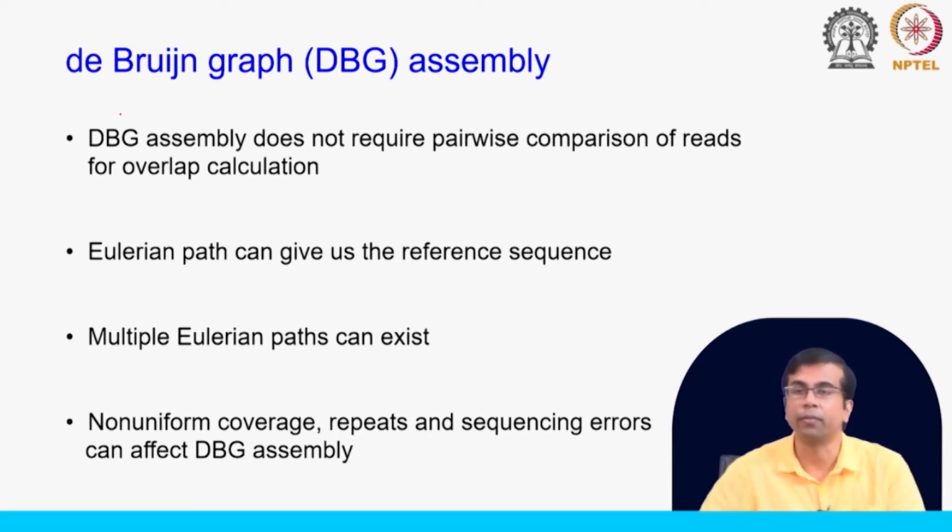One is of course to look for subgraphs that can be Eulerian, or maybe correct for sequencing errors. So, if you are working with long read sequencing data as well as short read sequencing data, you can use the short read sequencing data to correct the long read data. So, that will reduce the error. You can take different approaches to address these issues.